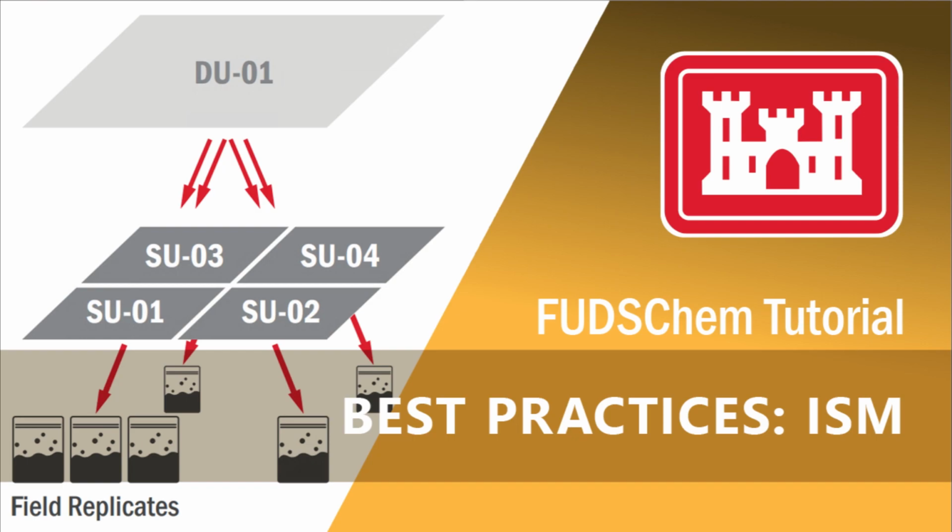This video will go over incremental sampling methodology, or ISM, and recommended best practices. This includes best practices for entering locations, sampling information, laboratory data, and for validating ISM data in FUDSChem. The Interstate Technology and Regulatory Council, ITRC, Technical Guidance Incremental Sampling Methodology, ISM, update should be referenced for the application of ISM. The video description lists timestamps to help you navigate to the portion that you need.